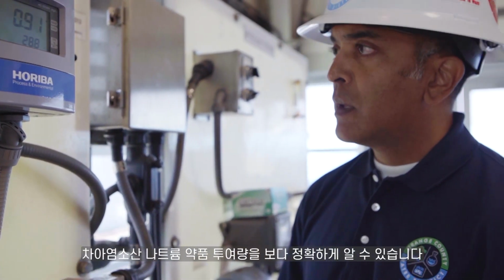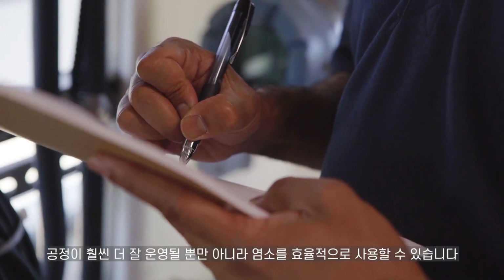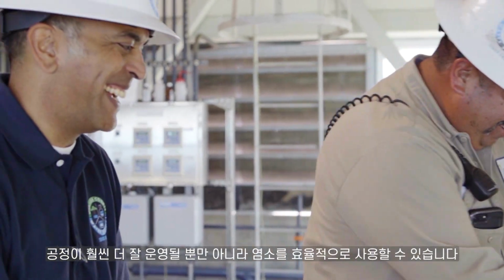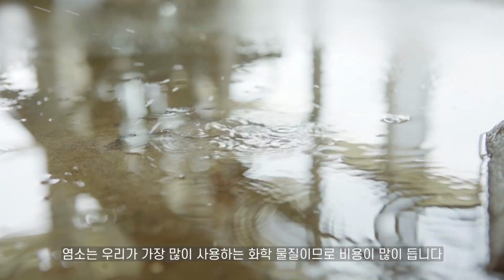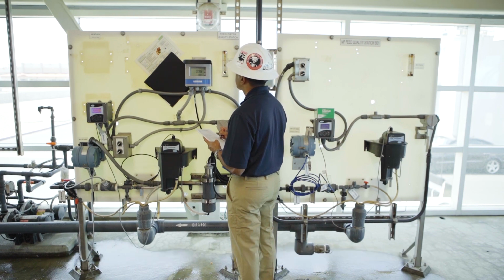By having the ammonia analyzer and being able to target exactly how much chlorine to add, not only does it make our process run better, but it efficiently allows us to use chlorine. Chlorine is the chemical we use the most of, and so it costs quite a bit. So we would like to be as accurate as possible in our use of it so that we can save on our operating costs. And the ammonia analyzer helps us to optimize our chlorine usage.